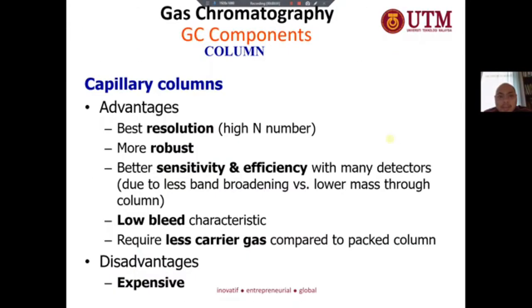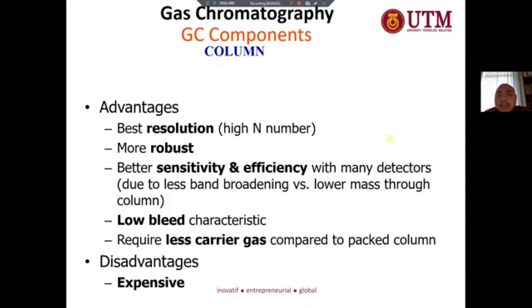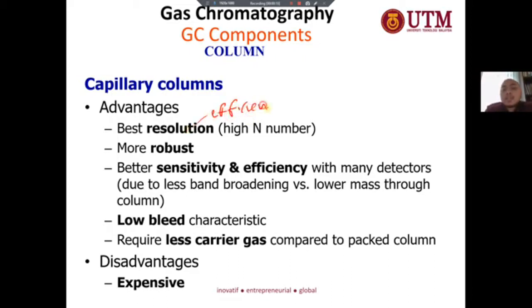Let's look at the capillary column advantages and disadvantages. Capillary column can give you the best resolution. This is my mistake actually: best efficiency and also resolution, both.